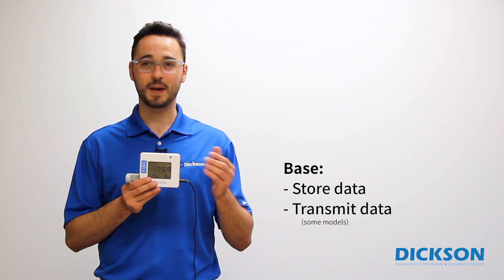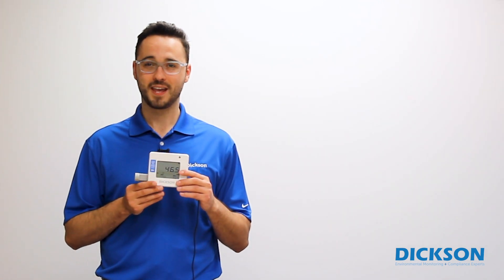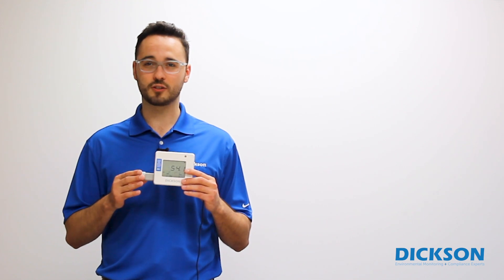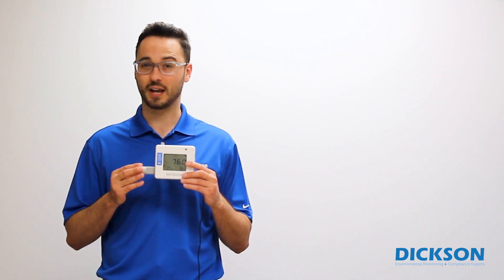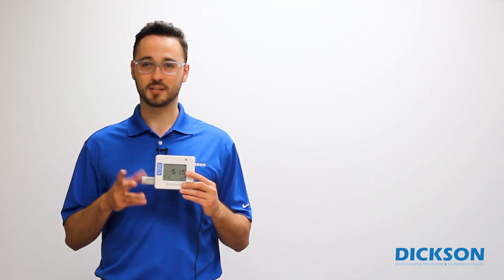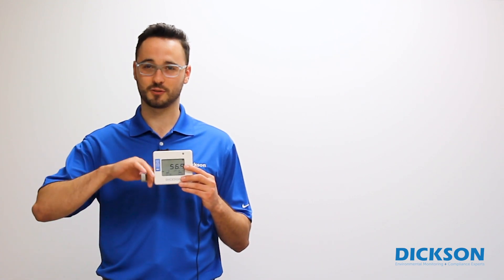And this piece is the base or the body of the logger. Performing a sensor swap is quick and easy. After you've purchased your new sensor with the appropriate NIST or A2LA calibration, you'll receive your new sensor in the mail. To begin, start by unplugging the original sensor.